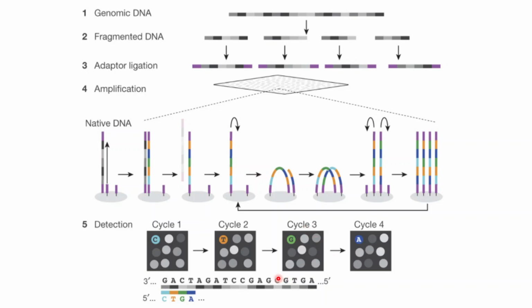So basically, if you have a fragment there, you can actually map out this particular read sequence through the different intensity of colors that is generated in the flow cell and through the camera detector that is present within the sequencing platform. So this is how they are mapping out a read.